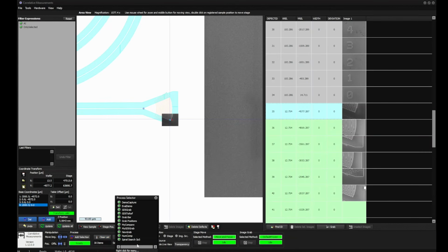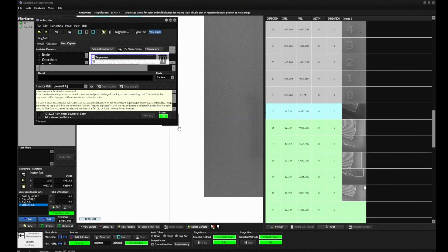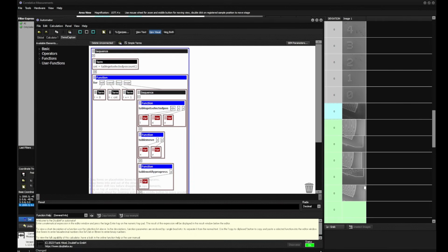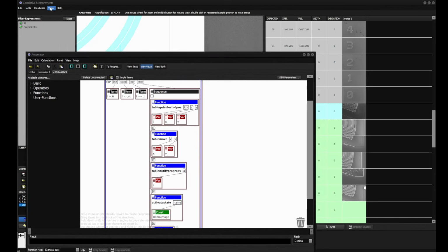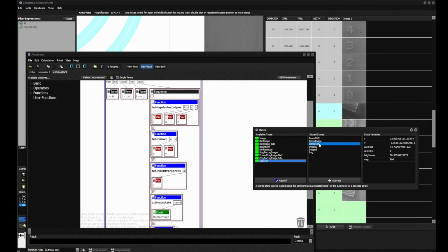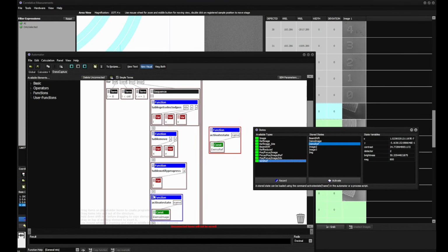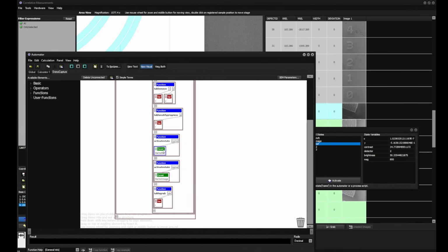So we could now just use our demo capture here, and like that, we have the table move, we have the activate state. When we want to do it visually, we just go to the state thing, take this one and put it down here, like that. Now we have the demo ref, the demo image, and the grab. So first we correct the position by using beam shift, then we capture the image, and then we grab it.